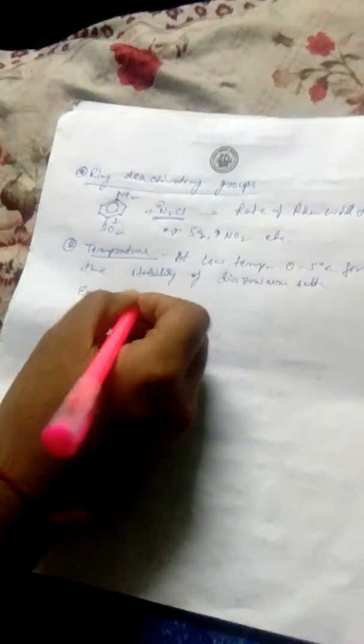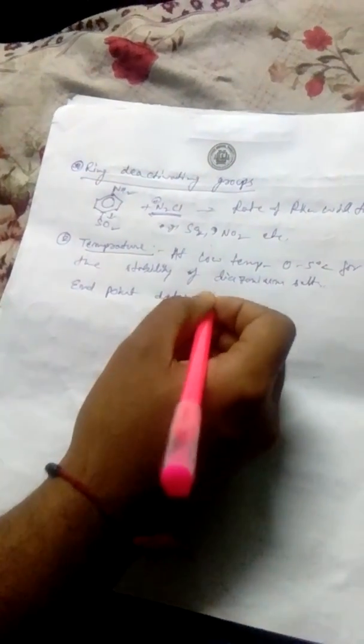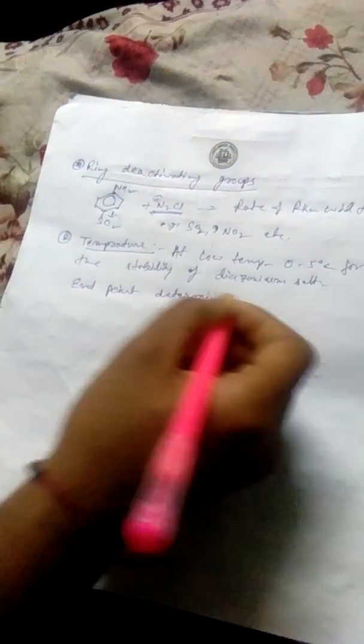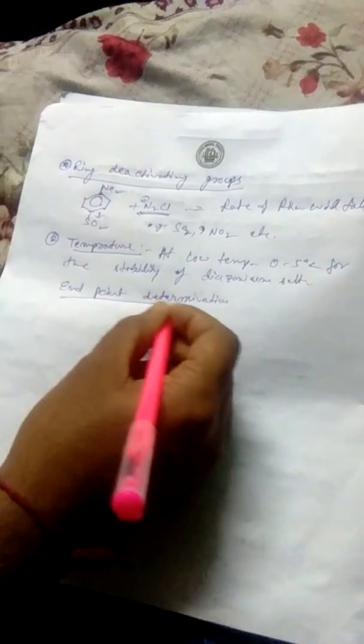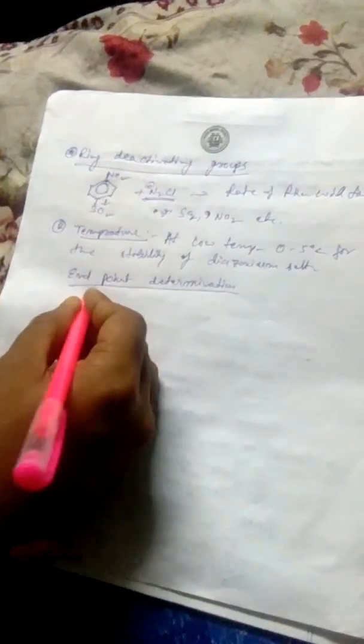So again, in the titration, at last we detect the end point. End point determination: the end point can be determined by two methods.